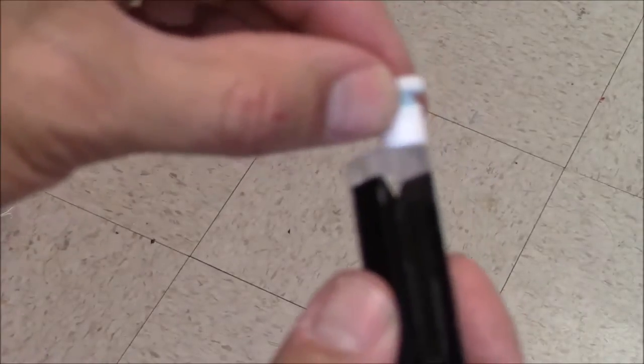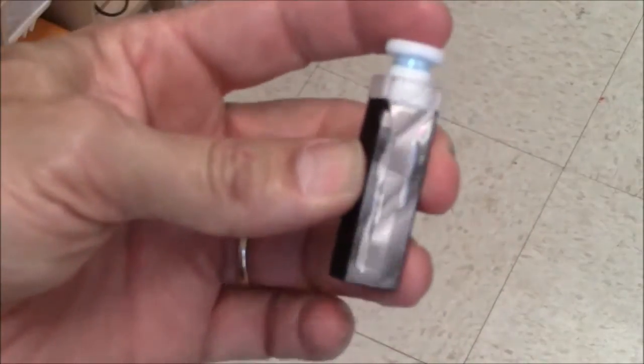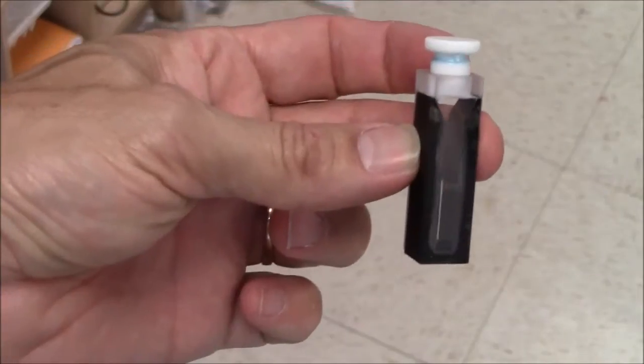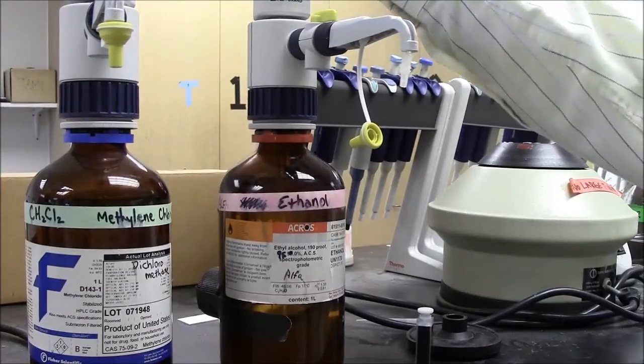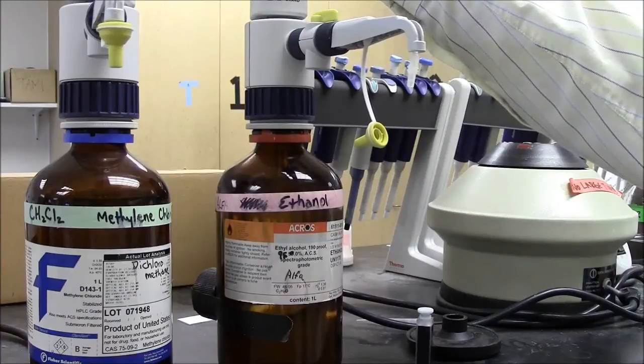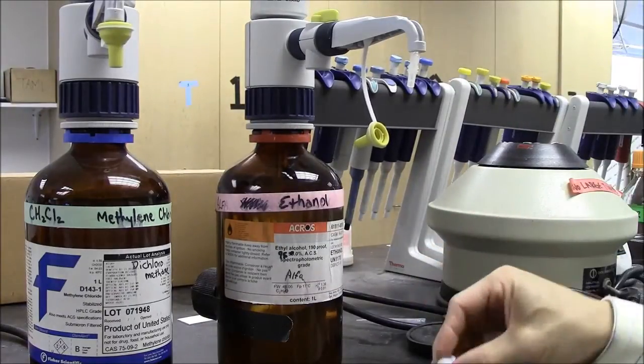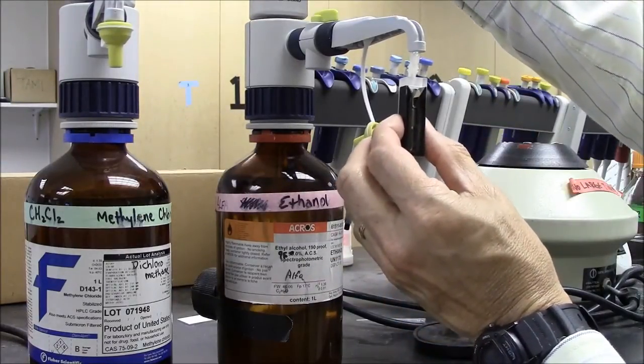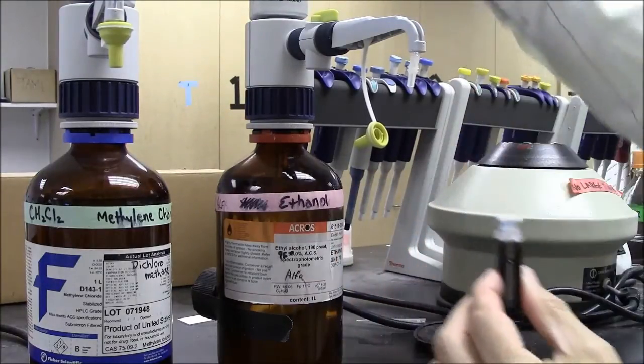It also comes with a stopper so that you can easily seal the top and mix your contents, or save it so that no solvent evaporates. Typically, the first thing you do with your cuvette is to fill it with some clean solvent. In this case, I'll use spectrophotometric grade ethanol. I'm putting in 0.95 milliliters, which is the equivalent of 950 microliters.